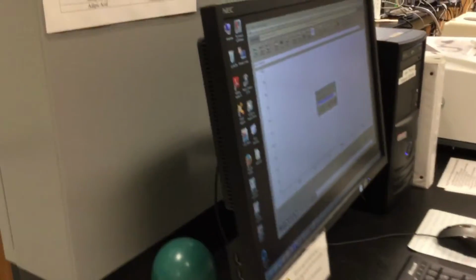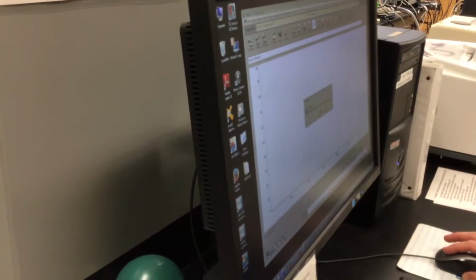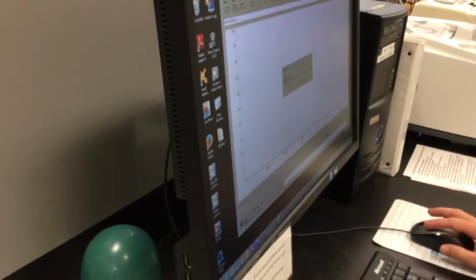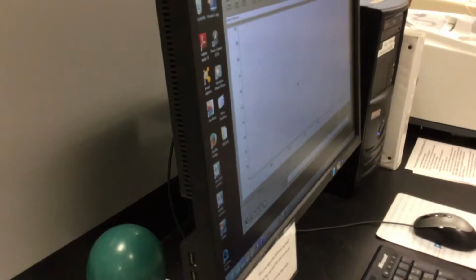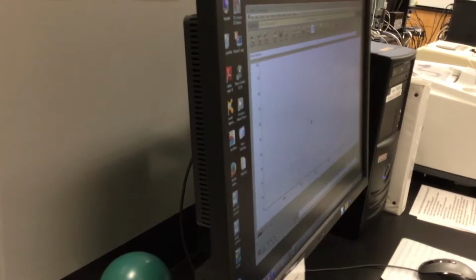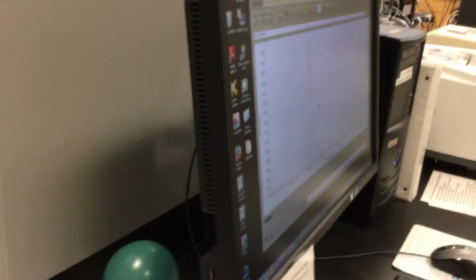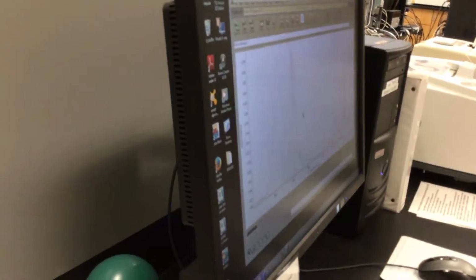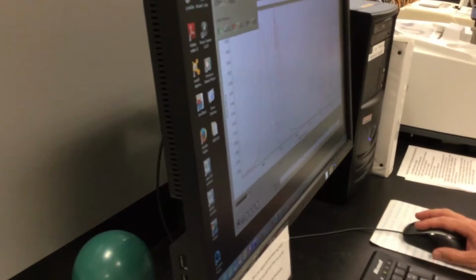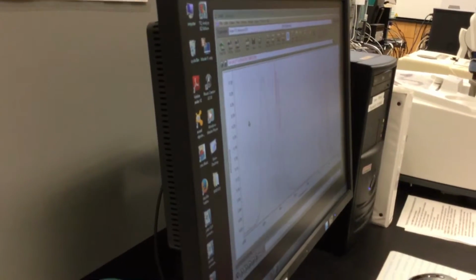Let's go ahead and collect the sample. I click collect sample. It'll give you some date and time, and you can just say, yeah, it's good enough. And it'll ask you to confirm. Prepare the sample. It's done. Say okay. We're going to wait for 8 scans again. Is that alcohol? That's alcohol. Yeah, good job. And yes, we do want to add this one to window 1.